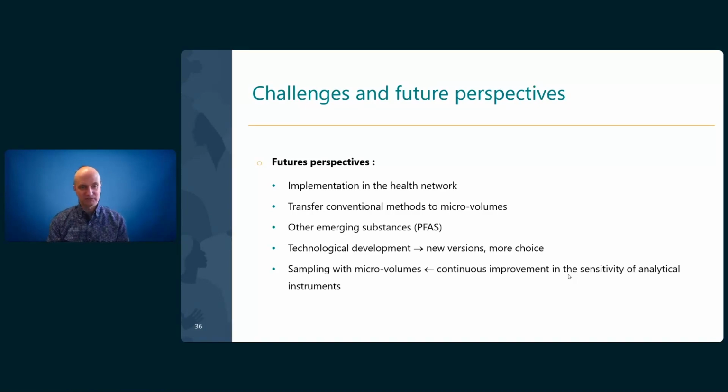As a future perspective, I would like to mention our main goal, which is to implement this technology in the health network. So we're working hard on these aspects. We want to bring them as an alternative in the hospitals for blood collection. Unfortunately, it's still the case that it's very difficult to collect samples for babies, newborns, children, and other categories of patients. So for that reason, we need an alternative, and we work hard on that aspect.